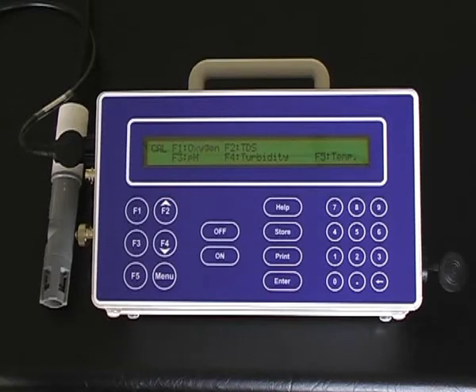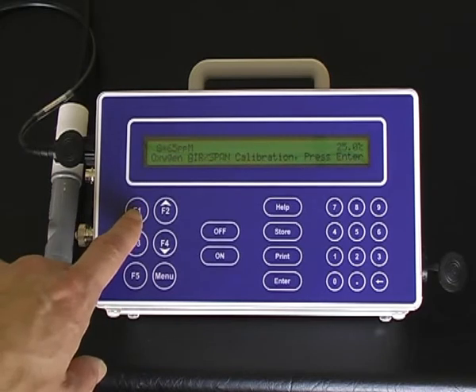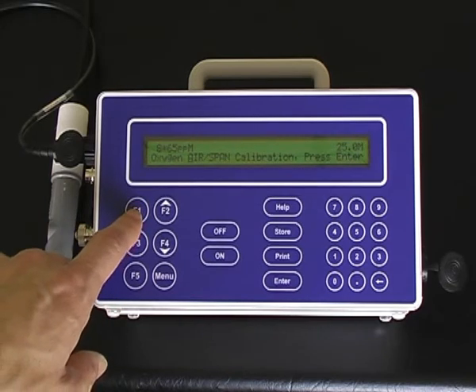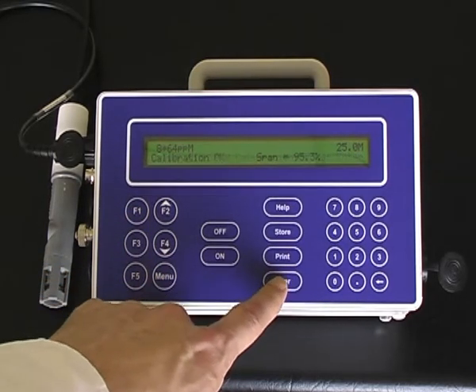Allow the dry sensor to equilibrate in air. Press F1 for oxygen, and once fully equilibrated, press enter to calibrate the second point.